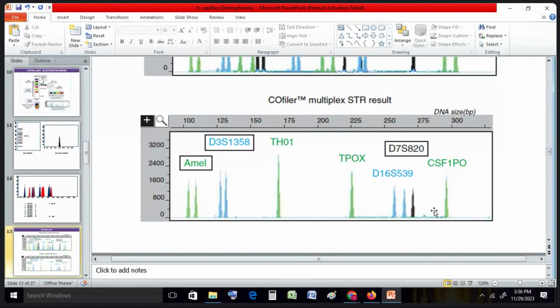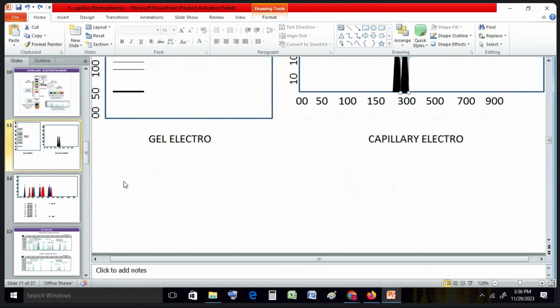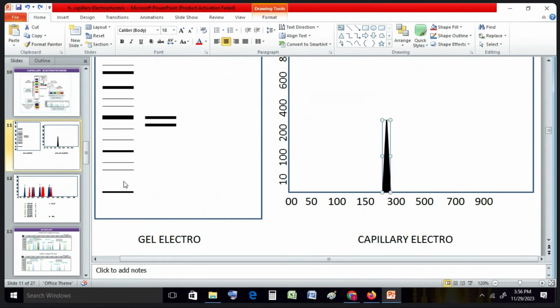What represents the length of the DNA or height of the DNA? Height টা দেখি বুঝাচ্ছি। Y axis এ কি আছে? Last class যে বলছিলাম, in the Y axis you see 800, 1600, whatever the number. What does this increment mean? Y-axis এ বাড়তেছে. What does it indicate? This is the amount of DNA. Amount of DNA last class যে বলছিলাম মনে আছে কিনা? Concentration of DNA, sir. Exactly, amount or concentration of DNA.